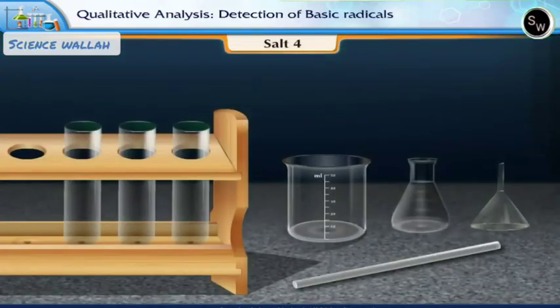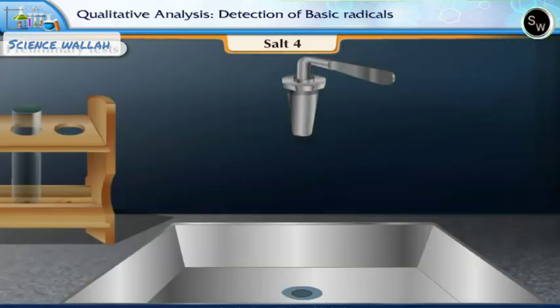Salt 4. Let us first start with the preliminary test. Wash all the apparatus with water.